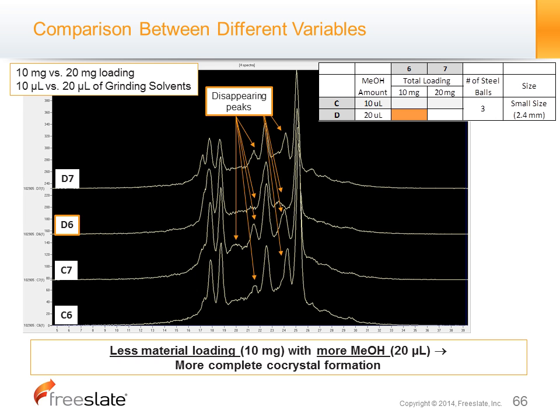As you can see here, D6 is highlighted, and what we're looking for is the peak that needs to disappear from the individual component, and how completely that peak went away. As you can see here, D6 has peaks. Here, I don't like this color.